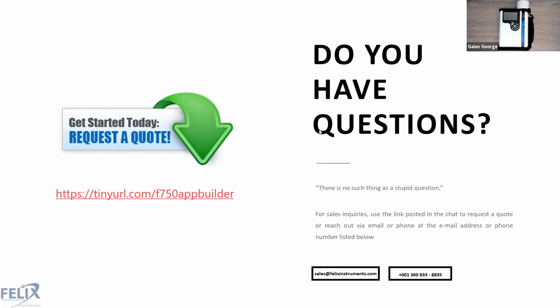The next question from Sebastian is, what is the purpose of the archive option? So the archive option is our solution for rapid organization of data, as well as being able to rapidly upload to not just the SD card, but to FruitMaps if you wanted to, or a data server.